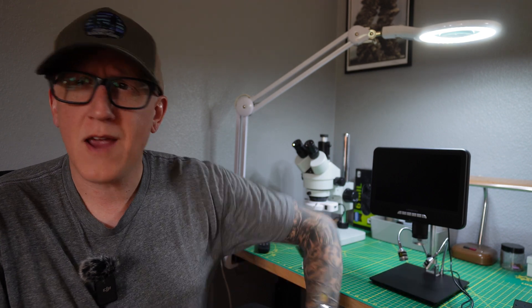Back here, this is a trinocular stereo microscope coupled with a camera — like the mirrorless camera that I'm recording this on right now. You can take some amazing images, especially when you add to it an XYZ lifting platform and we can focus-stack. This is something we've talked about a number of times here on the channel. However, the downside is the price — the price of that whole setup is honestly a lot, and that is out of reach for a lot of people.